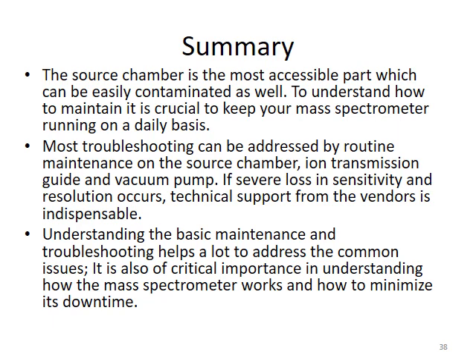To sum up, from a more practical standpoint, troubleshooting a mass spectrometer requires a basic decontamination technique in the most accessible parts, such as the source chamber. Through learning the basic troubleshooting skills, you would understand the instrument better. Understanding your instrument will give you confidence in dealing with those small issues.